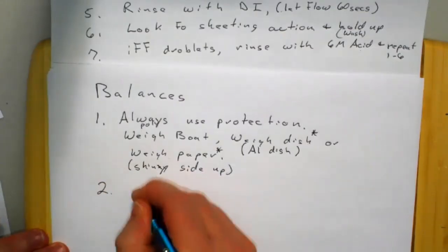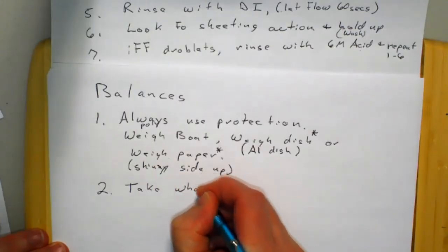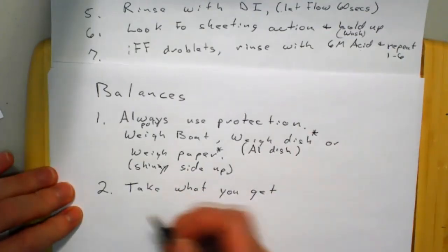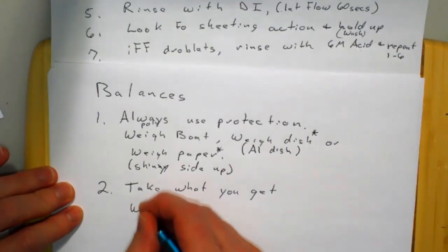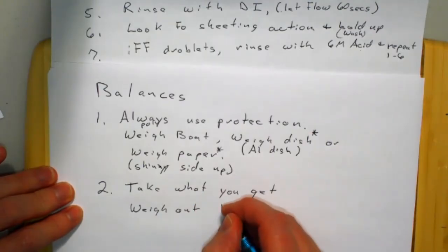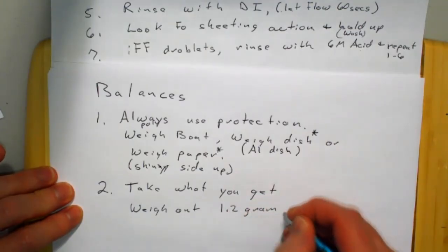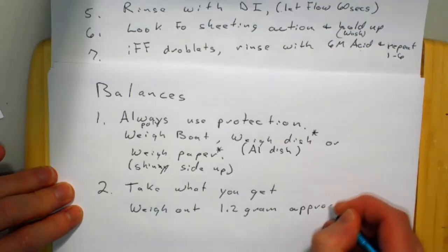Okay, so take what you get. This is the way we word stuff in the lab manual: weigh out 1.2 grams approximately, exactly.